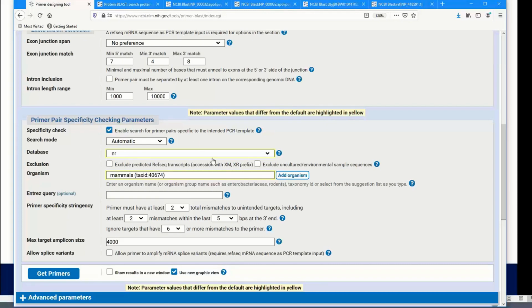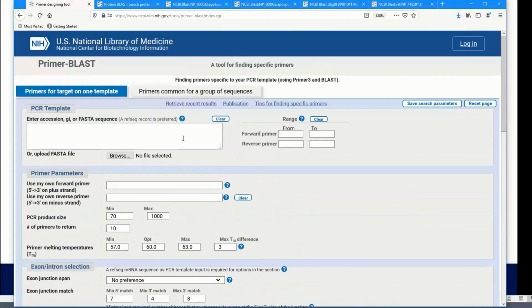Let's say you have a sequence you've amplified, and you want to identify the organism of that sequence. What should you rely on after you do a BLAST search? Should it be query coverage, percent identity, e-value? What would you look for to try to identify what that organism is?